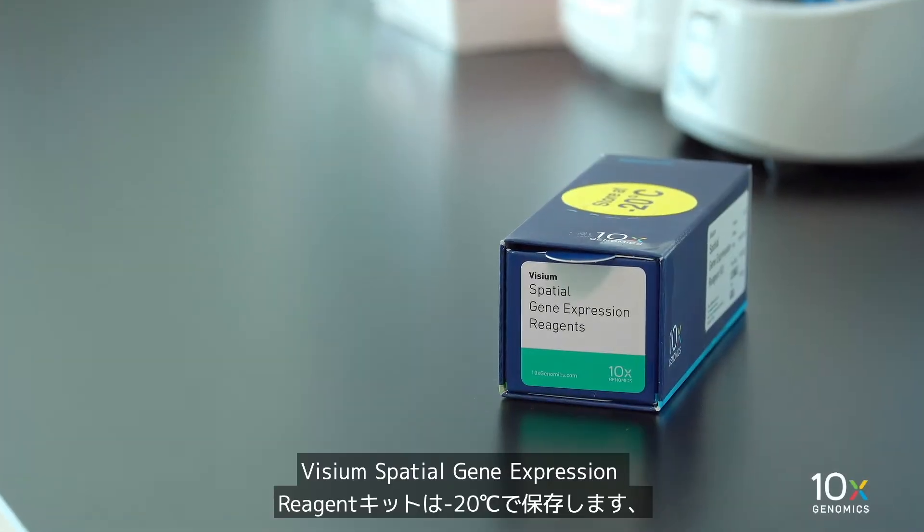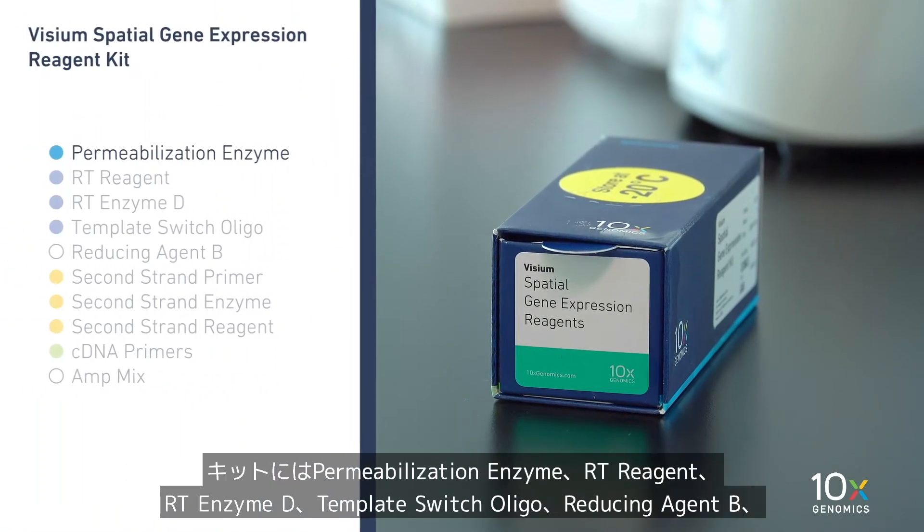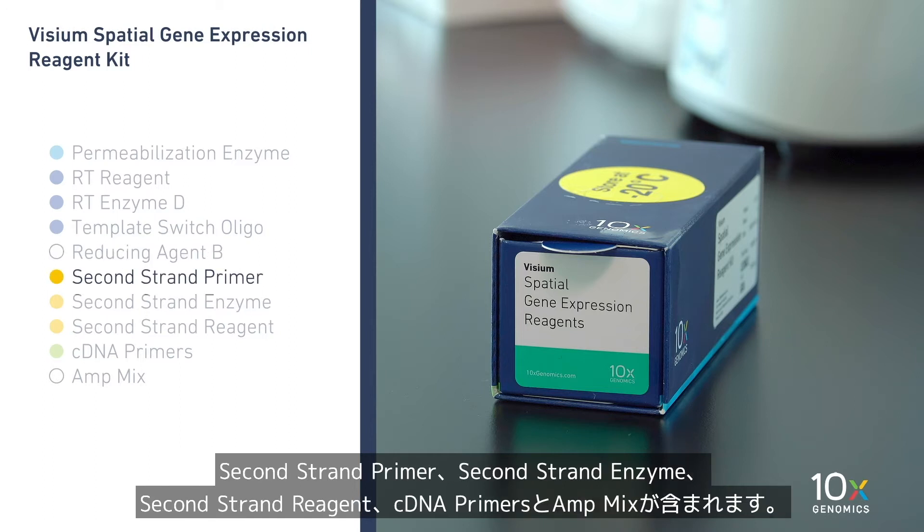The Visium Spatial Gene Expression Reagent Kit is stored at minus 20 degrees Celsius and contains Permeabilization Enzyme, RT Reagent, RT Enzyme D, Template Switch Oligo, Reducing Agent B, 2nd Strand Primer, 2nd Strand Enzyme, 2nd Strand Reagent, cDNA Primers, and Amp Mix.